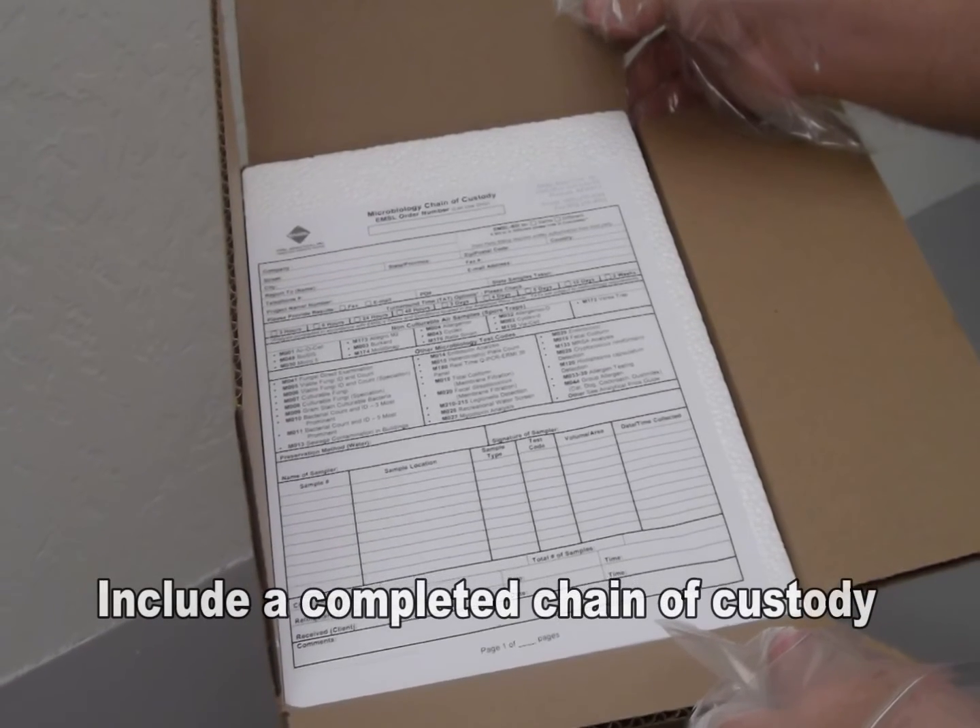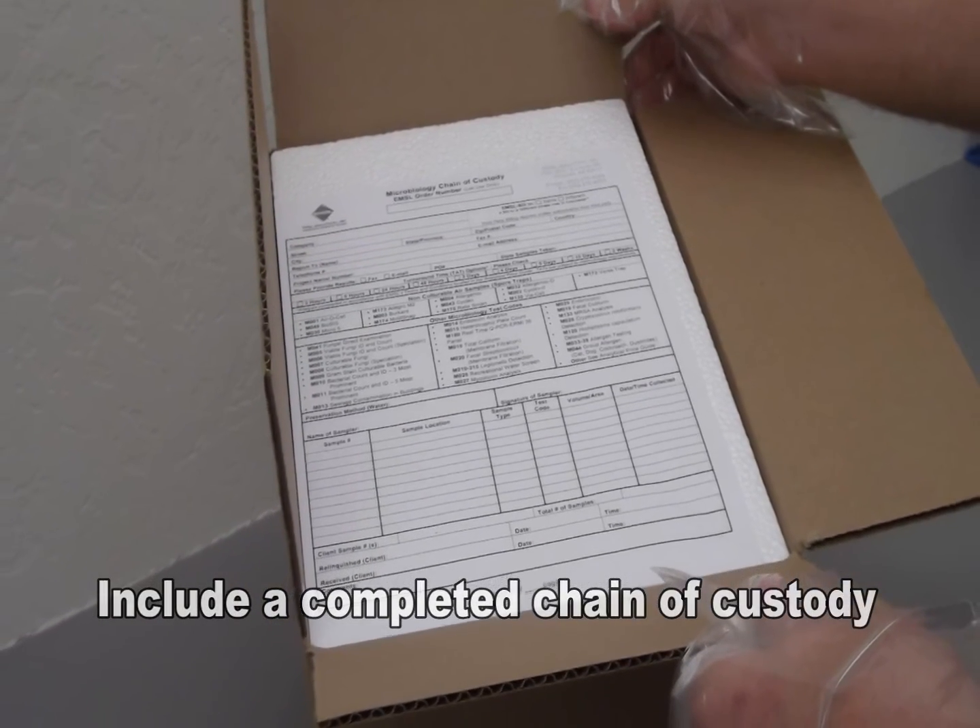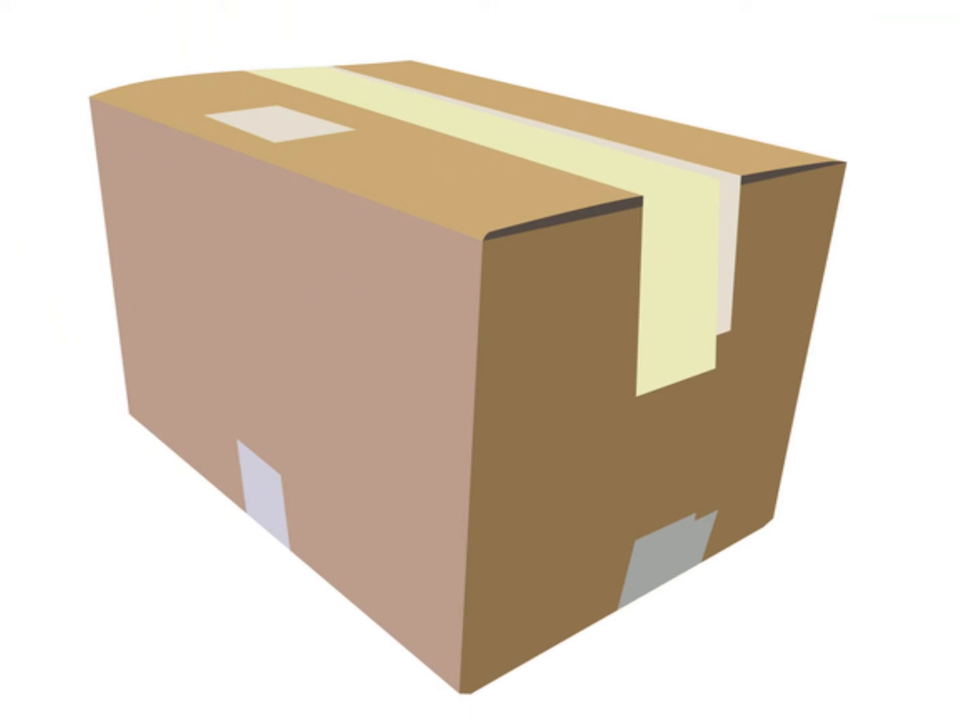Include a completed chain of custody. Ensure that it is packaged so that it doesn't get wet or damaged. Identify the sample type on the outside of the package as a food sample.